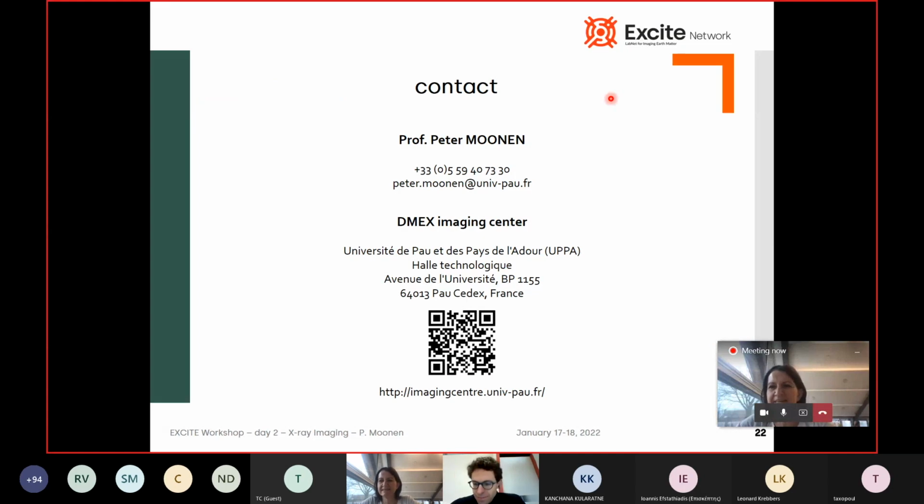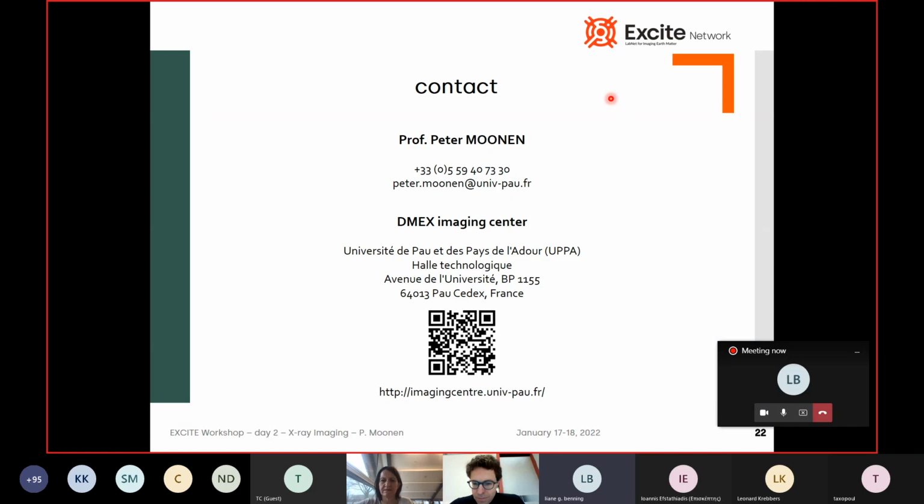Liana? Yes, thank you. I just have a question. You mentioned that obviously hydrogen has a different attenuation. If you would have samples frozen inside of ice, would you be able to use that as a transmitting background and still go through it without actually losing resolution? It means you could scan bigger pieces of ice or select parts of your ice which are just in the center. In a rock core you can't do that, but maybe in an ice core you could. Is that possible?